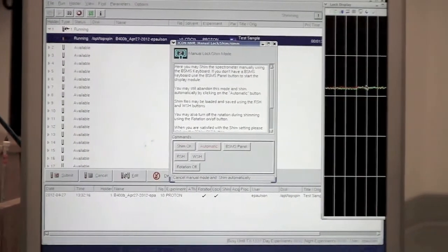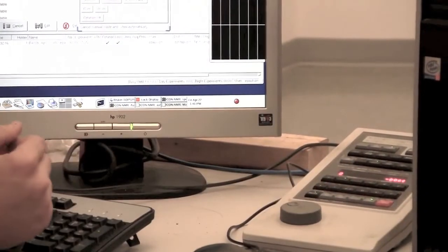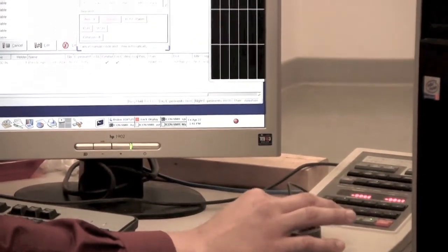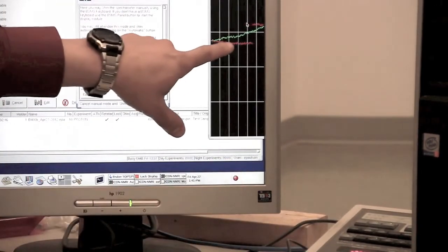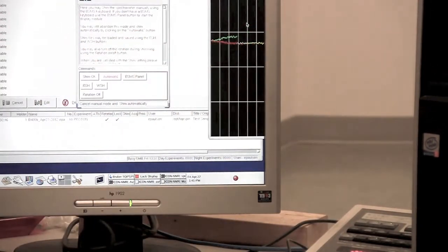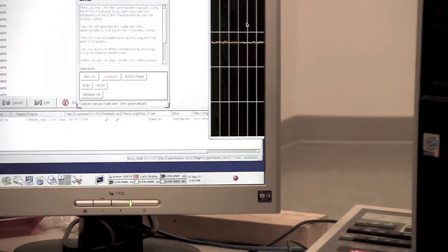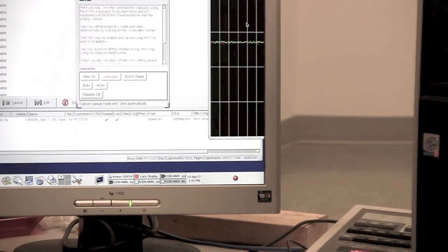So what we're going to do is to adjust the Z1 shim. This is a linear distortion of the magnetic field along the axis of the tube. That's why we call it Z. We can turn this knob and we can look for its effect on the magnetic field, on the lock signal here. Now the lock only has a signal where the deuterium is exactly on resonance. So if the signal is weaker, that means that only a small fraction of the sample is on resonance. If the signal is stronger, then a larger amount of the sample is on resonance.